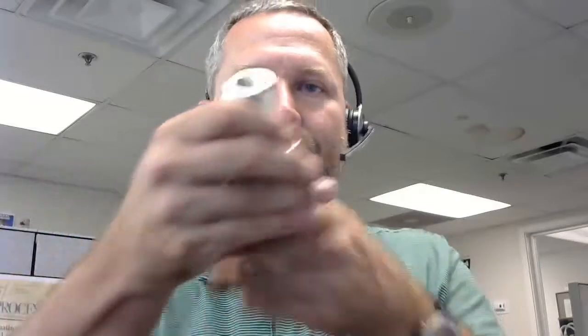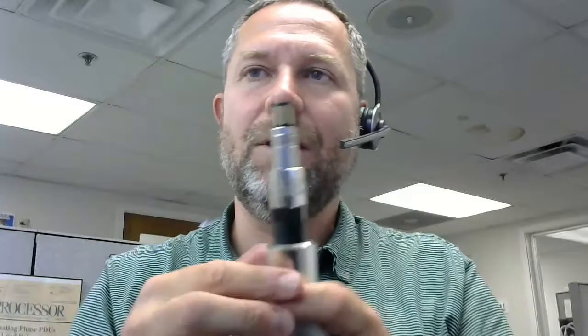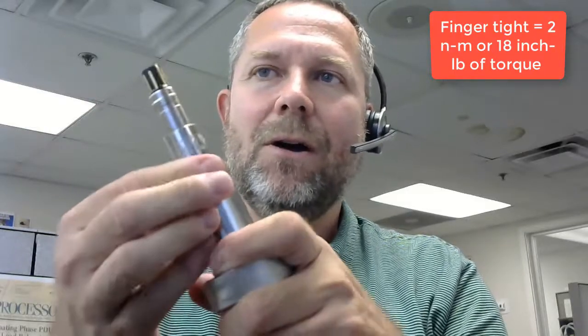Now let's take a look at installing the sensor into the housing. It's important to note that the O-ring is what does the sealing — it's going to bottom out on a lip inside the fitting. When we put the sensor in here, push it in, and finger tighten it. Finger tight is enough to seal off the sensor from the process.